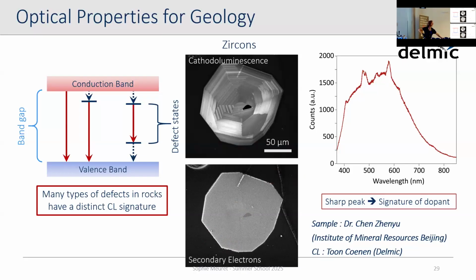And the contrast you see in the upper image is intensity. So that's cathodoluminescence. I guess this is filtered at a certain energy, and you can see that depending on the position on the rock, you have different intensity. Okay, because it's filtered, you see some brighter and darker.